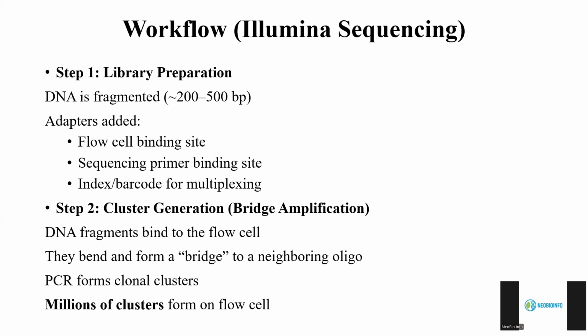The second step is cluster generation, where bridge amplification occurs. Each DNA fragment binds to the flow cell. They bend and form a bridge-like structure with the neighboring oligo. Moreover, PCR forms a clonal cluster. Millions of clusters form on the flow cell.